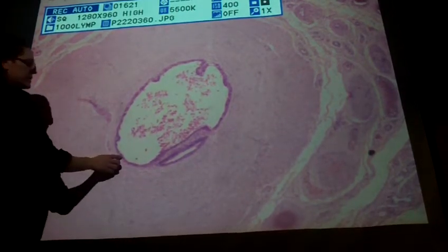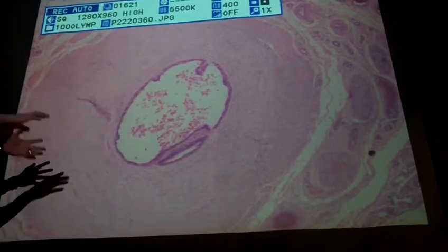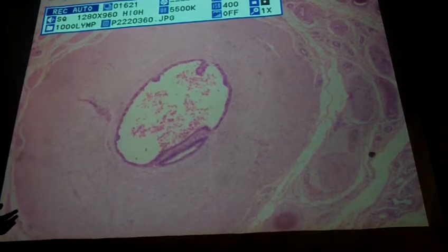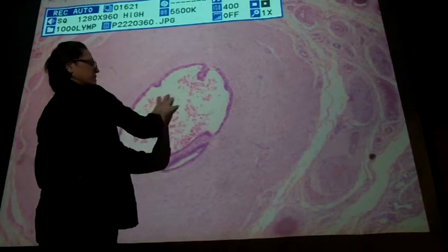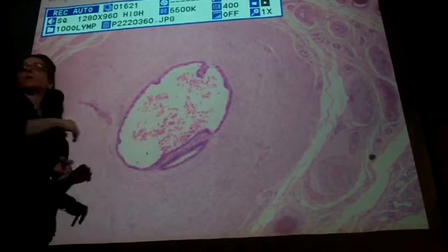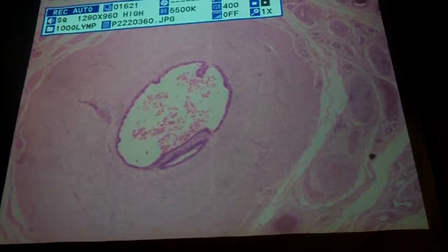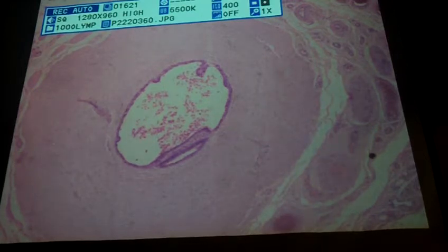cells. And you can see that these have kind of a columnar shape to them, particularly when you compare it to an artery or a vein that would be next to this. What you're seeing in here, these are actually sperm cells in the middle. So you may have a ductus deferens with sperm cells in it, you may not. It just depends on that particular organism, what was going on with the sperm cells at that particular point in time.